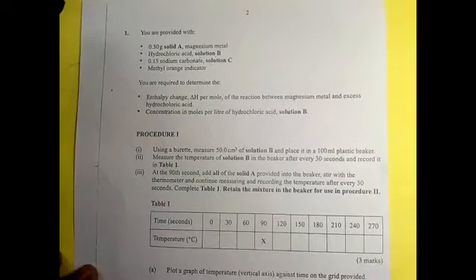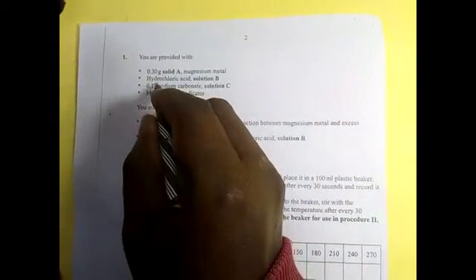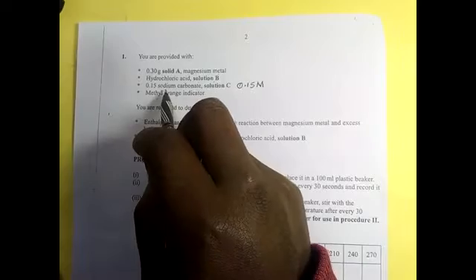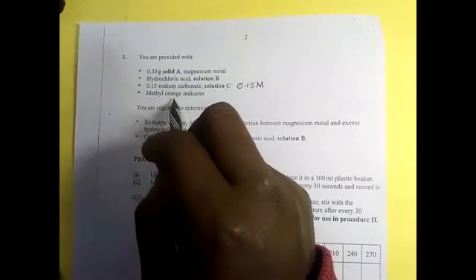You are provided with 0.3 grams solid A, magnesium metal, hydrochloric acid, solution B, 0.5. There was a mistake. It is supposed to be 0.15 capital M molar sodium carbonate, solution C, and then methyl orange indicator.